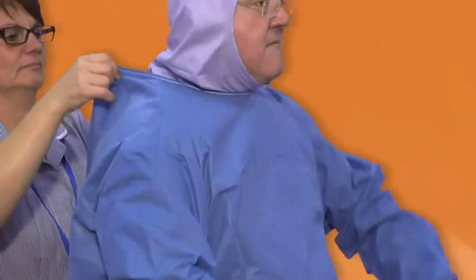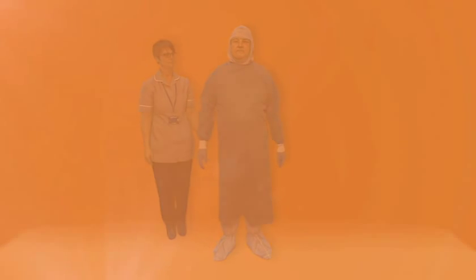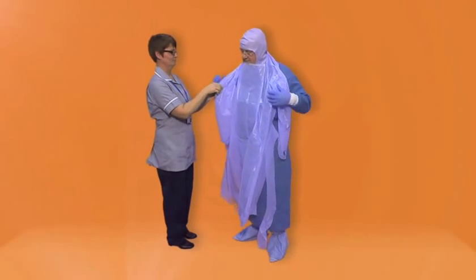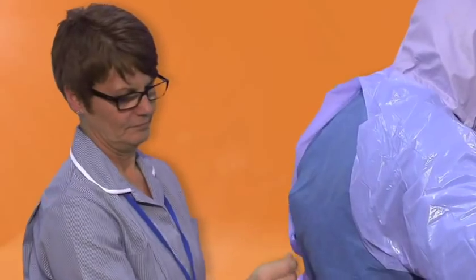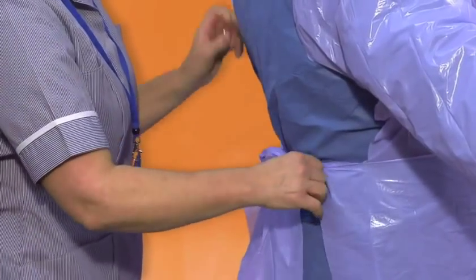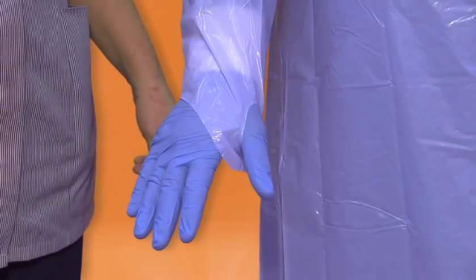Your buddy will then ensure your gown is securely tied at the back. The apron. With assistance from your buddy, hook the apron over your head and place your arms in the long sleeves. Your buddy will then tie your apron at the rear. Ensure you use a long sleeve thumb looped apron and use the thumb loops as demonstrated.